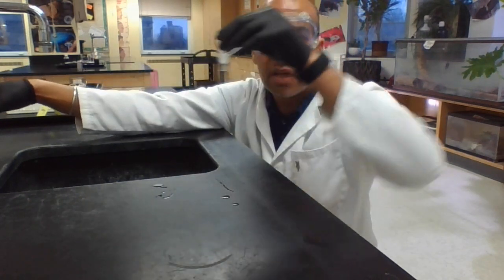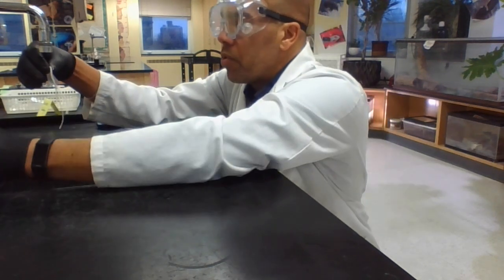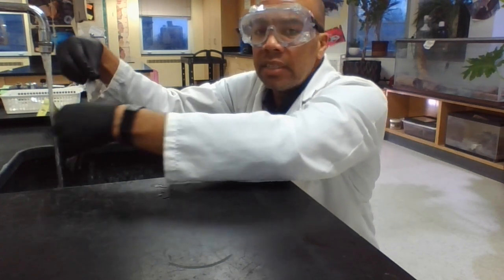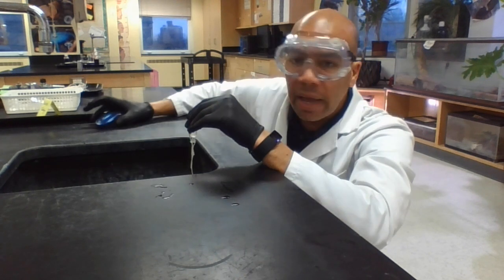You got to rinse off this bag of glucose and starch, because you don't want any that got out when you tied it to affect our experiment. You want everything to really be inside. You don't want any of it to be contaminated on the outside. Okay, I will see you in a sec.